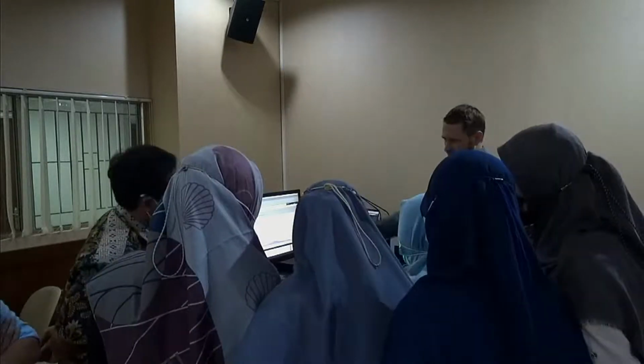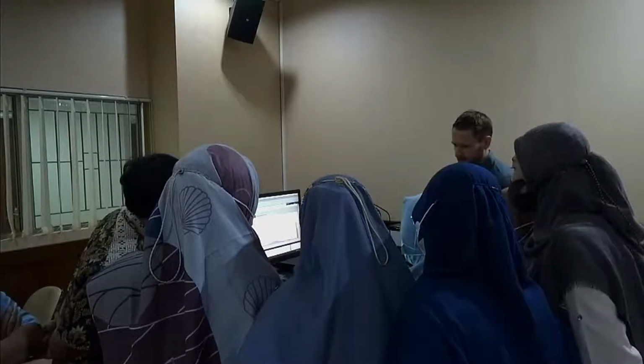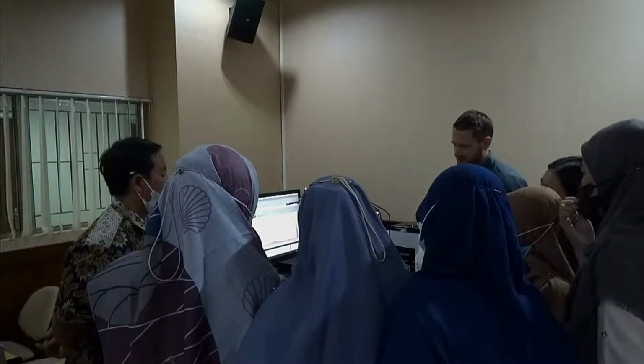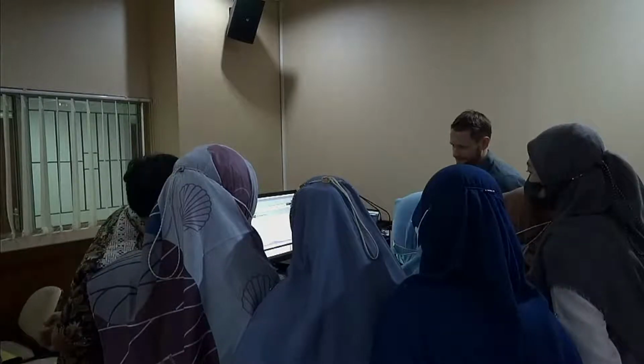We talked about temperature control. You can see up there which temperature our system is at. And the first measurement is already in. Second measurement is on the way.